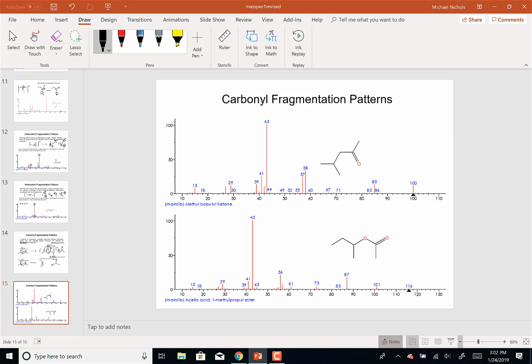In ours, all the ions are in there doing figure eights in what's called an ion trap. Then the instrument ejects all but one mass. So I can tell our instrument, I want everything but 87 gone. And now I have a mass spec full of 87 fragments.